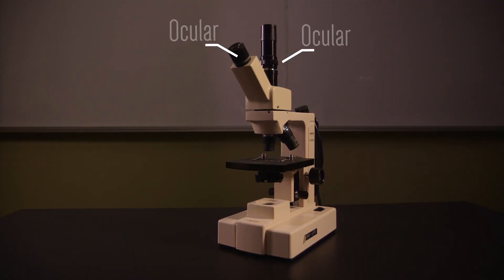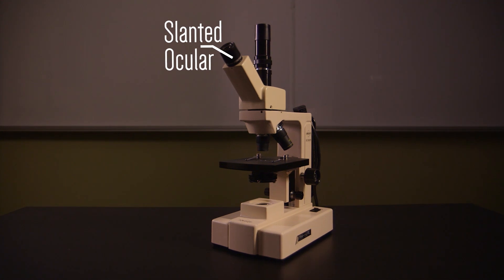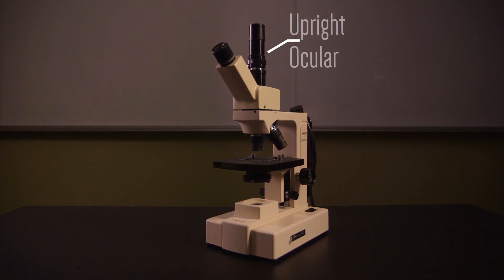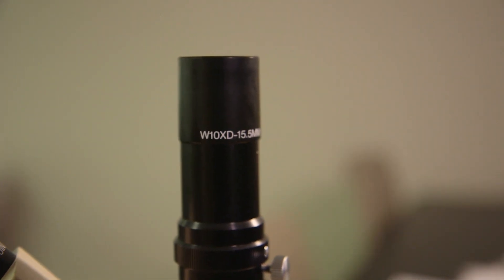Let's review the parts of the microscope. The lenses at the top are the oculars, or eyepieces. You will use the slanted one when you are seated. The upright ocular is useful for when you are standing at a low table. The magnification of the ocular is printed on the rim of the lens.